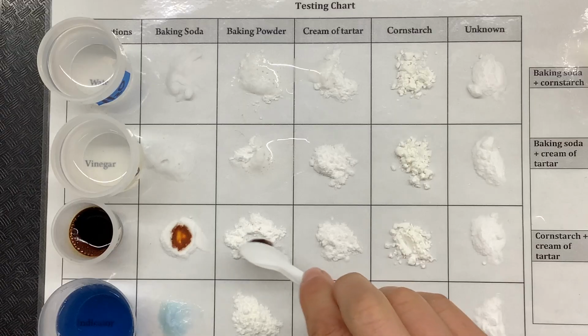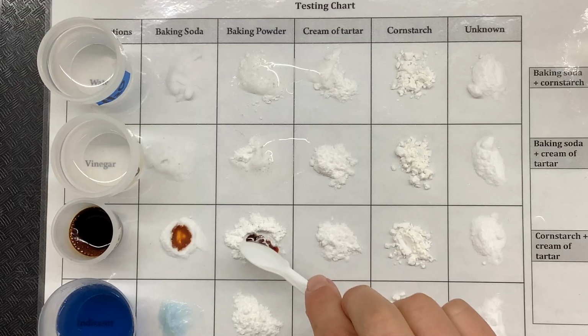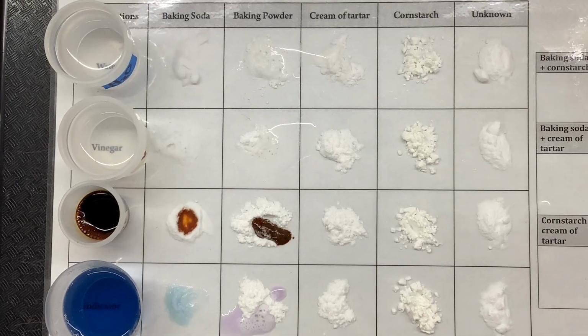Looks pretty like dark color there. Okay. Now we're going to do the indicator with the baking powder. Oh, look at that, it's turning purple. That's cool. Okay, we got purple for baking powder in the indicator.